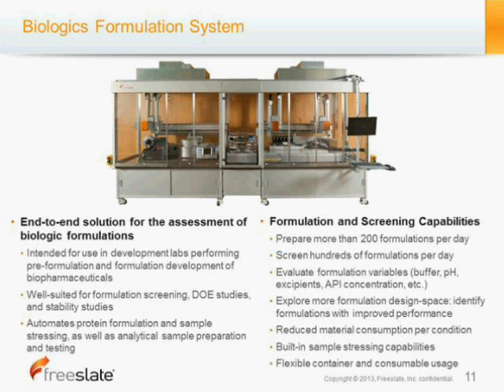So the idea here is that it can actually prepare more than 200 formulations per day using liquid handling and basically using a liquid compounding method. It can screen hundreds of formulations a day depending on what types of methods you're using and what are the different parameters of your methods.